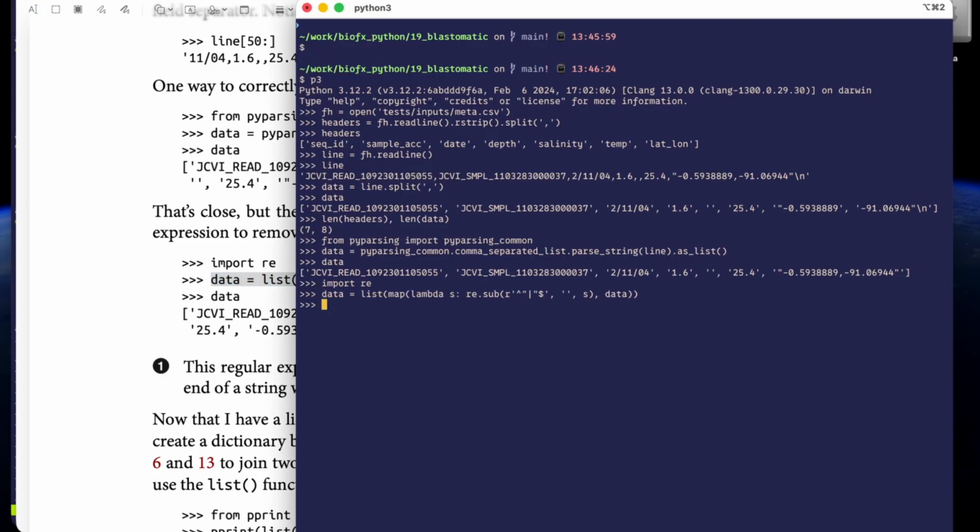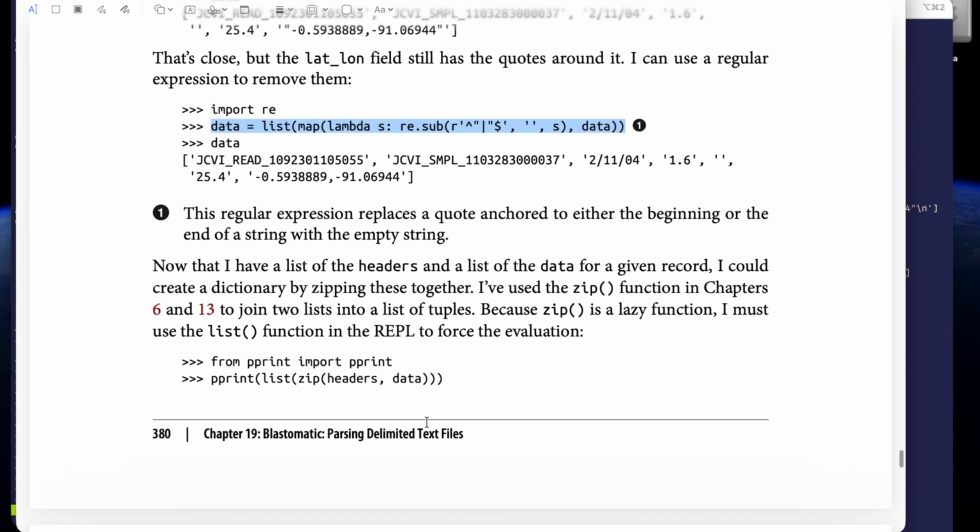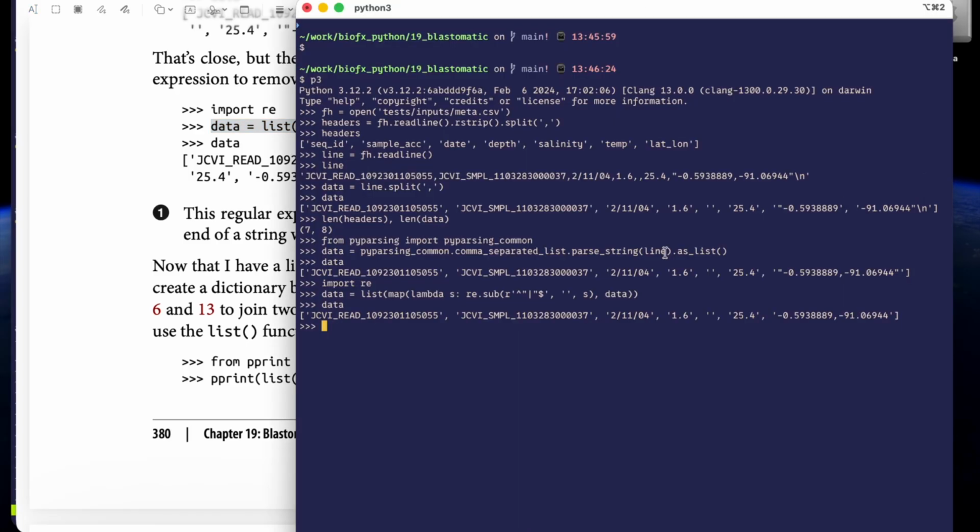And if this seems complicated, it is. I'm trying to show you that it's complicated because there's an easier way to do all this. So that's what data looks like now. It's now been pretty cleaned up. We've had to do some really, really manual stuff to get this data in a usable format. And we still have these two different data structures.